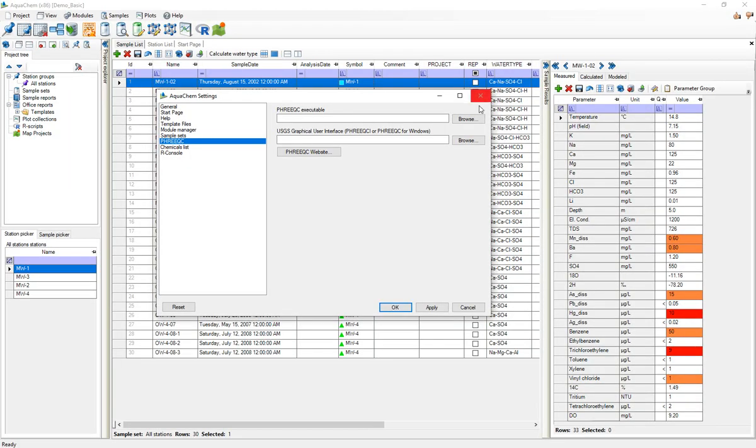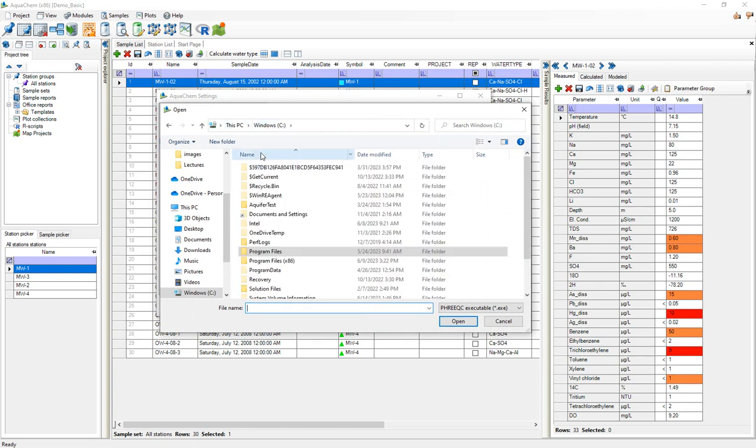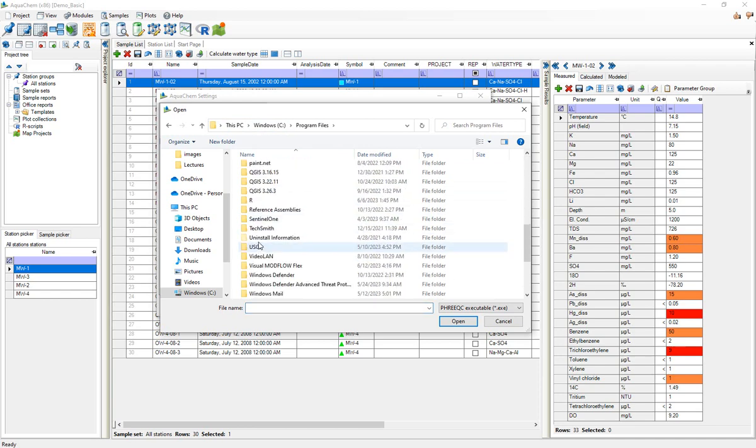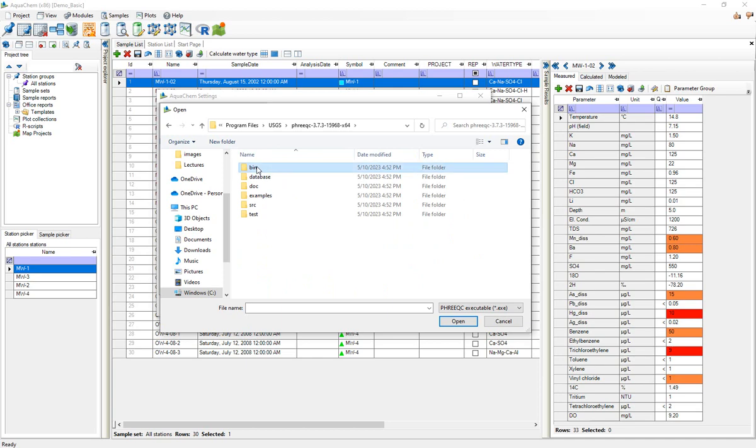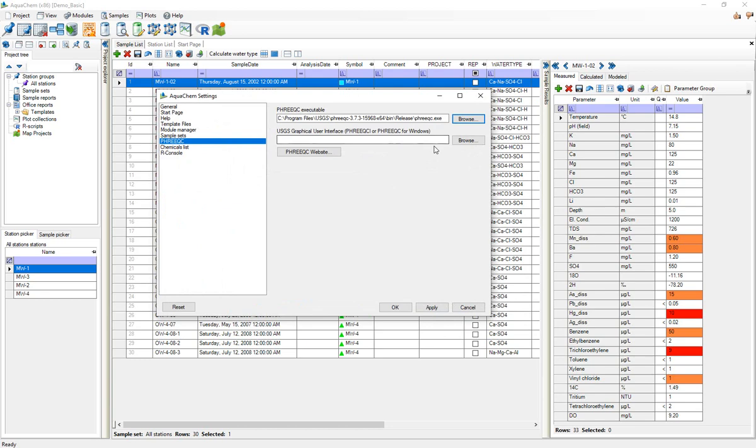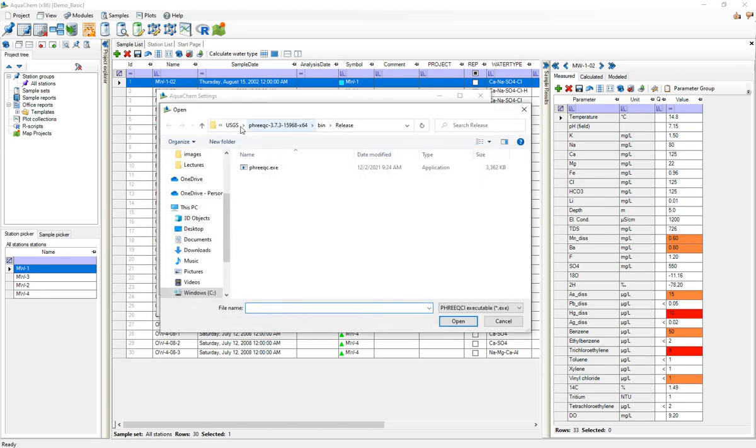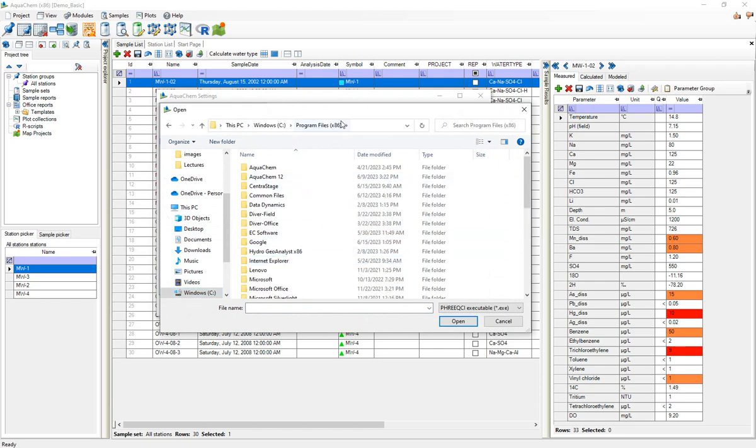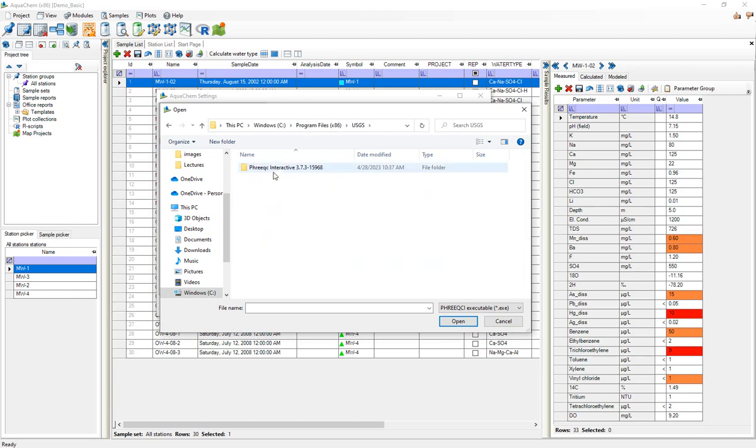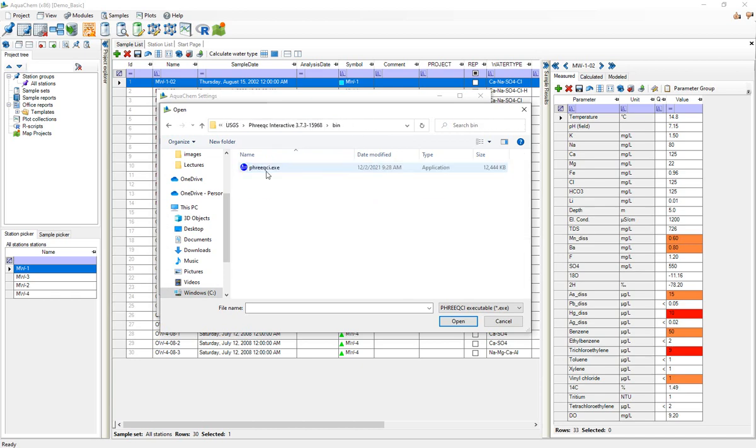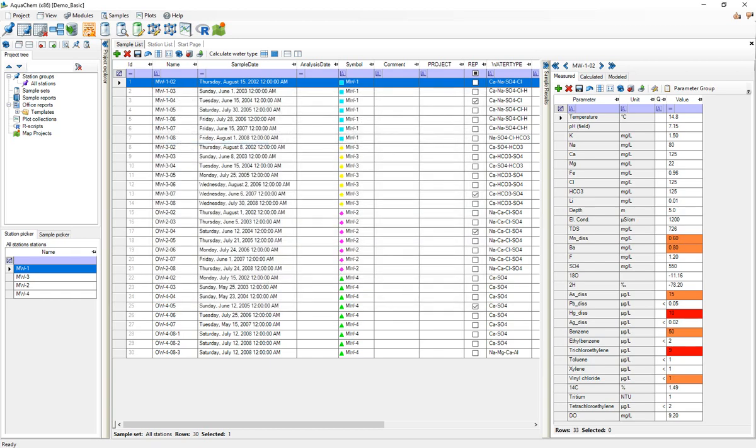So by default this PHREEQC executable, you'll have this PHREEQC folder and then in the bin and release you'll find PHREEQC.exe. For the PHREEQC GUI this is by default in program files x86, find USGS PHREEQC interactive bin, PHREEQC GUI.exe. Now I'll hit OK and that step is done.